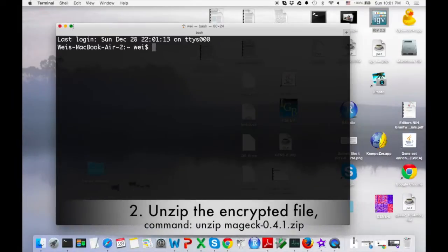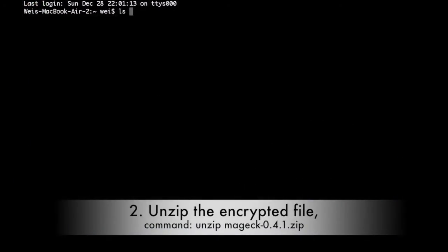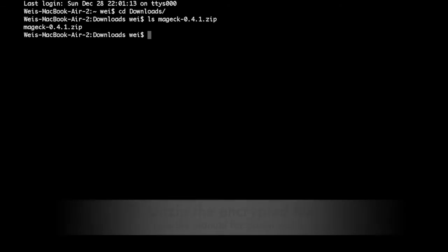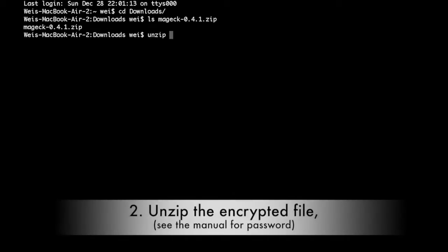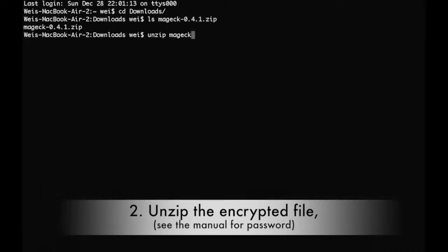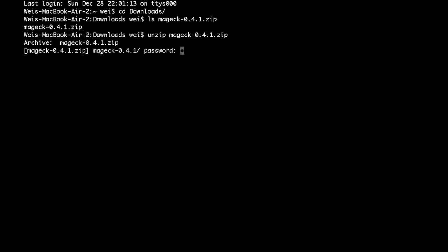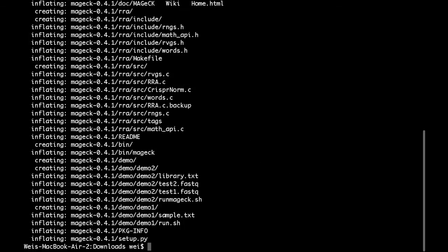After getting the password, open the terminal and locate the file you just downloaded. Use the command unzip to uncompress the source code. For example, if you downloaded the 0.4.1 release of MAGeCK, type "unzip mageck-0.4.1.zip". When prompted, enter the password.